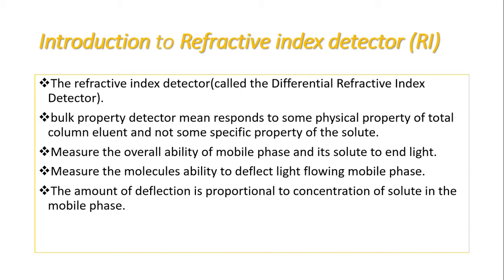It measures the overall ability of the mobile phase and its solute to bend the light. From its name, refractive, we have a refraction. The refraction of what? Of the light. The refractive index measures the ability of the mobile phase and solute to refract this light, and also the ability to deflect the light flowing through the mobile phase.